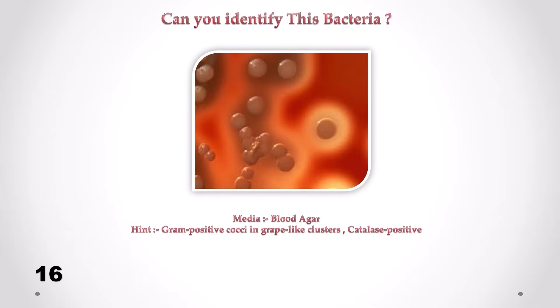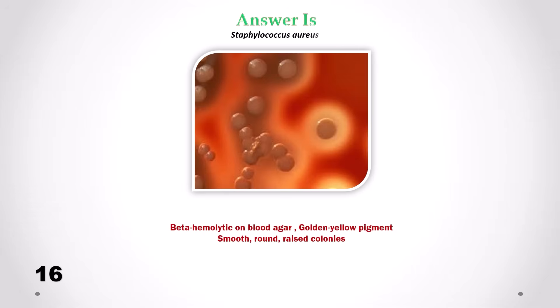Can you identify this bacteria? Correct answer is Staphylococcus aureus. We can see beta-hemolytic on blood agar, golden yellow pigment, smooth round and raised colonies.